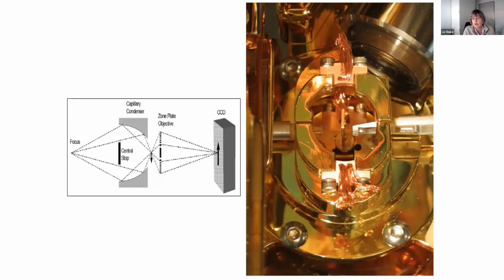And so this is just the inside of the X-ray microscope. Our samples, the cells, are grown typically on 3mm electron microscopy grids, and these are mounted inside the vacuum chamber on this mount here. Here is the optics bringing the X-rays down onto the sample, and here is the support for the optics that will then collect the X-rays having passed through the sample to focus them onto the detector.